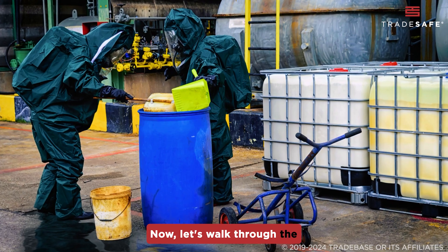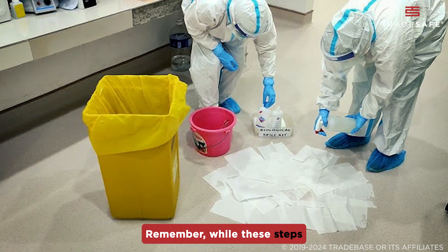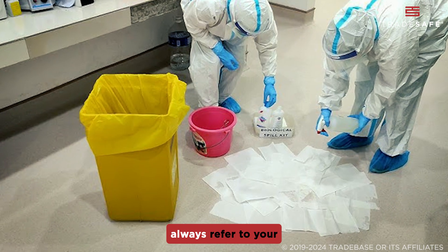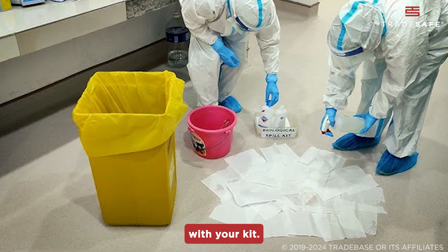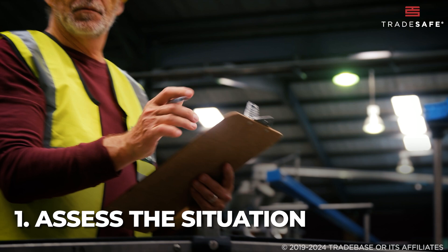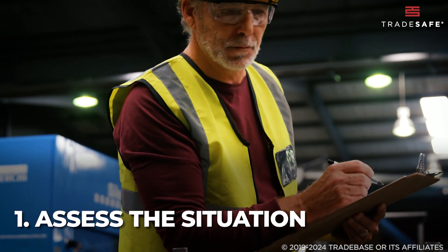Now let's walk through the general procedure for using a spill kit. Remember, while these steps apply to most situations, always refer to your workplace's specific protocols and the instructions provided with your kit. First, assess the situation — identify the spilled substance and potential hazards before taking action.